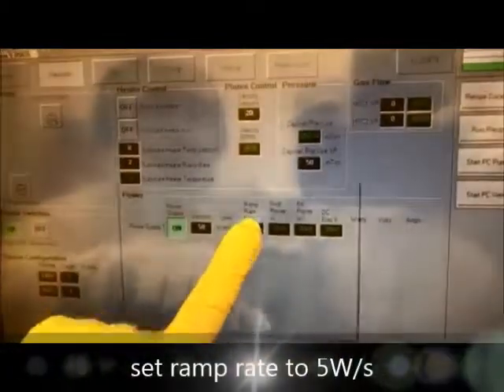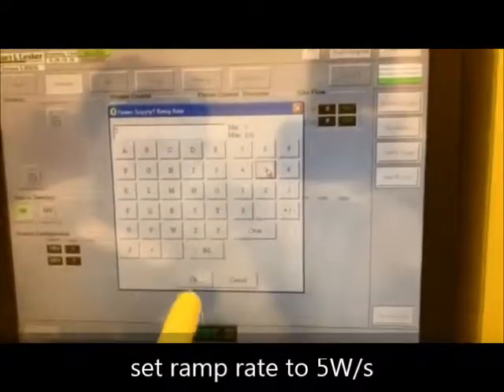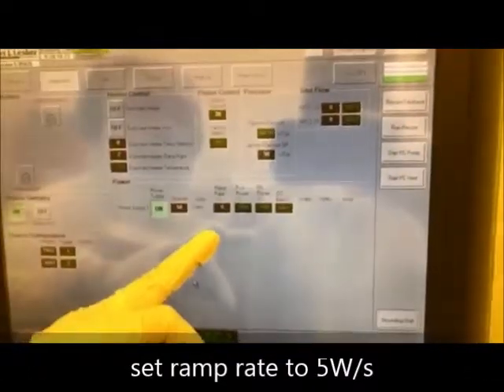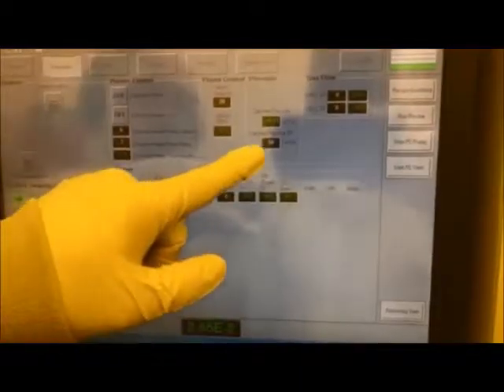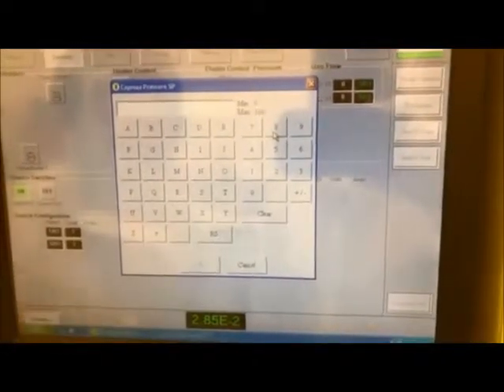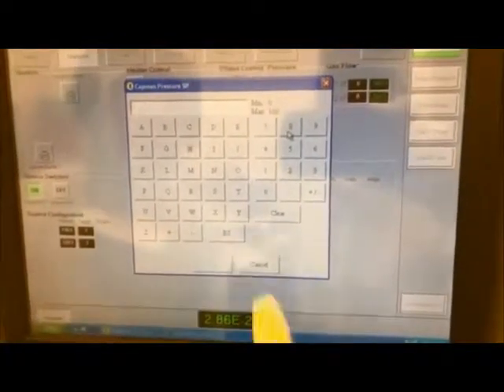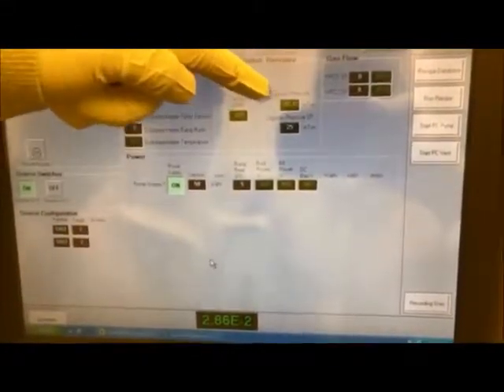But the first thing you want to do is kick the ramp. When we ramp up, we ramp 5 watts per second, so we set it to 5 watts per second. Once we set the ramp, we are going to set the pressure. We are going to reduce the pressure by half each time. So we start from 50, and we are going to bring it down to 25. We click 25, okay, and you can see the pressure should gradually go down.